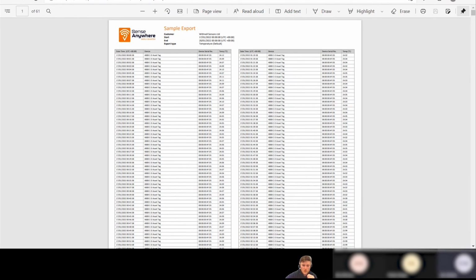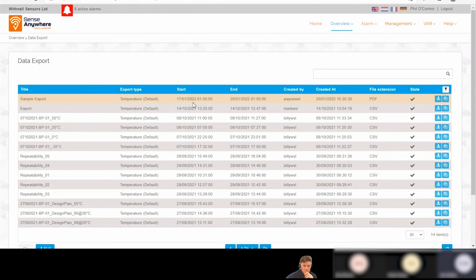That's perfect. Yeah, I suppose from our point of view, we have our own bespoke software, and we're using validators ourselves, and we use the Veritex. I said, but we do a raw data export from those systems, and our systems are able to read a CSV, and we produce our 17025 certs from that. So, but we can look at, I can look at that myself anyway. I can come back to you if you have any kind of questions on that.